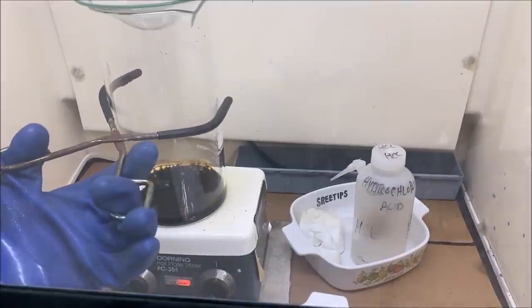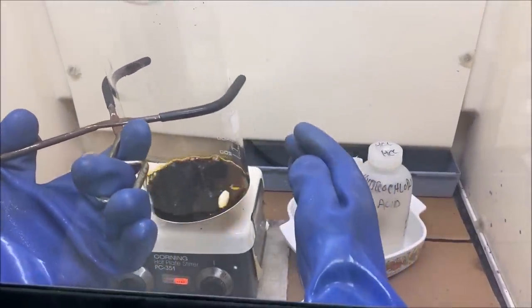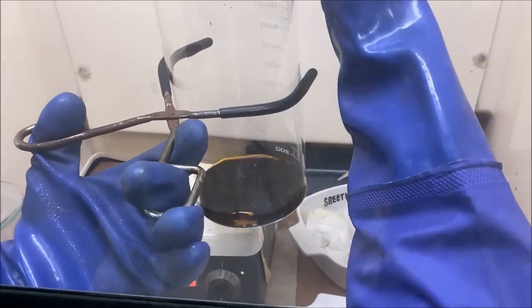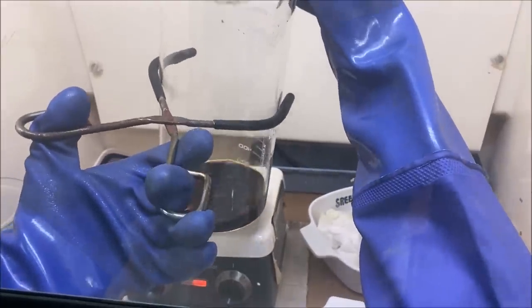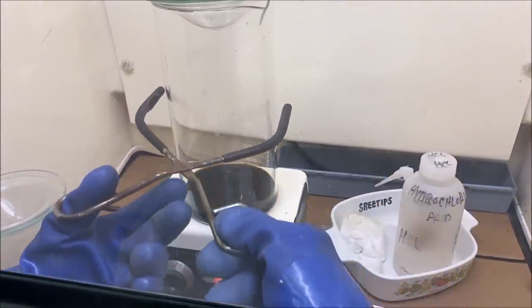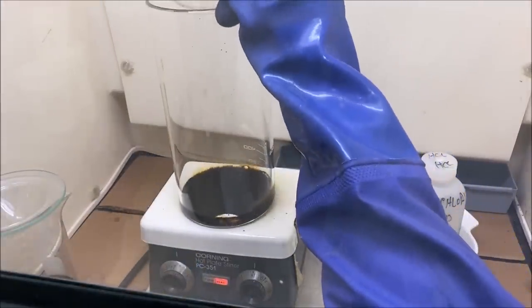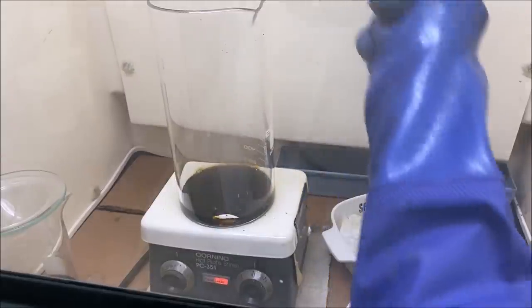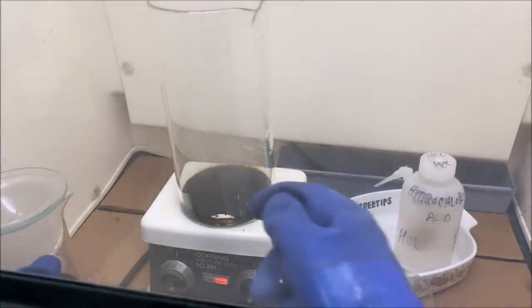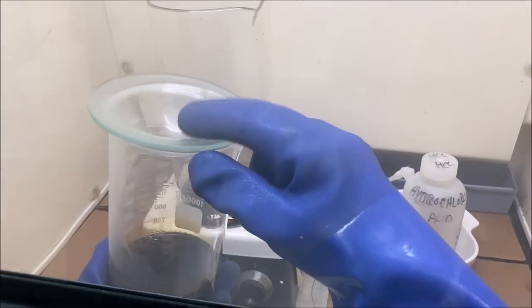Probably been on here about 7 hours now, maybe 8 hours. I've had at least maybe 2 liters of hydrochloric acid in there and probably 400, maybe half a liter of nitric. And I just leave it on the heat and it boils down, and then I'll add more of those acids to keep trying to put the platinum in solution. It's very resistant. It does not like to go into solution, even with the hot aqua regia here. So now I've got most of it to go into solution.